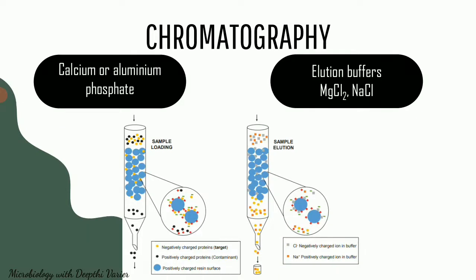Now the small molecules will take much longer time to come through that. So that is why we use size exclusion chromatography. But like I said earlier, we can even go for affinity chromatography, where we are going to use a particle that is very, very specific for the viral antigen. So we can use an antibody, make it stick together. But ultimately, what are we doing? We are taking the resin or matrix in the chromatographic column, making that stick to the virus and then making that unstick from the virus. This is the simple way of explaining chromatography.